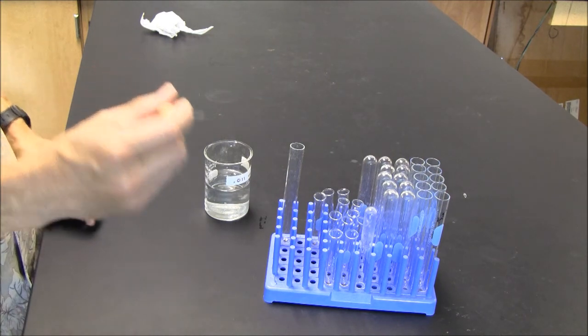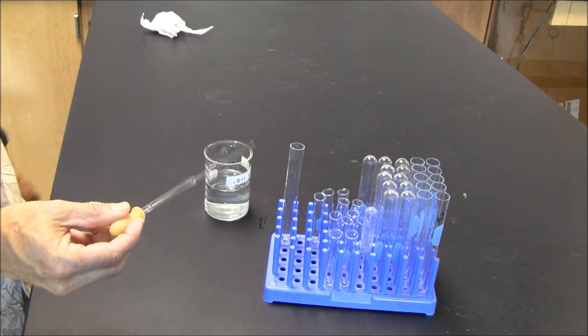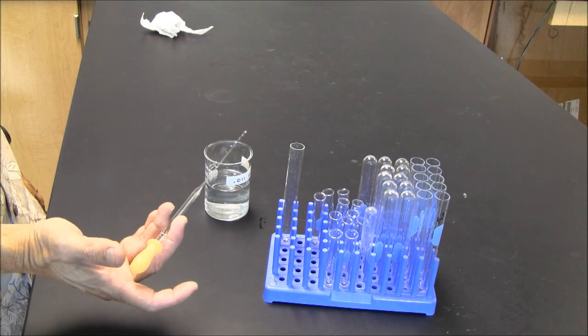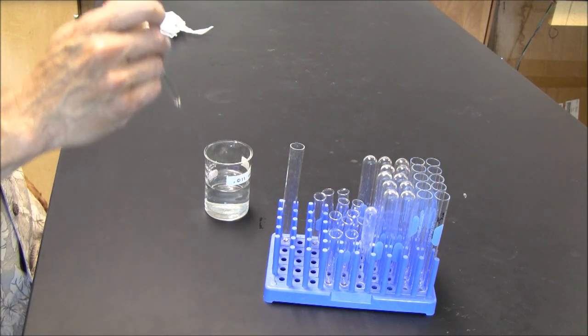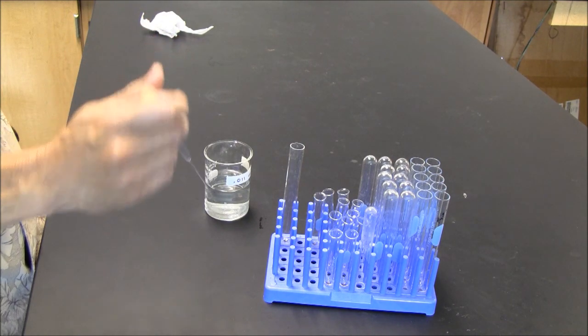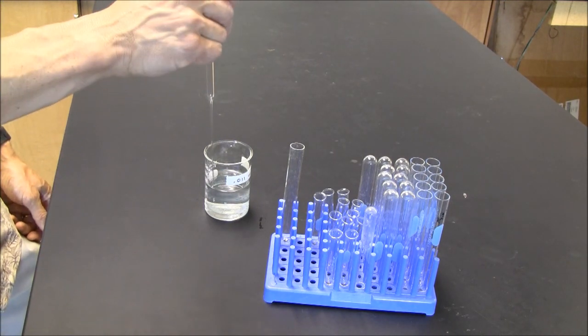Beginners tend to grab only the bulb. And as you can see, the pipette is very wobbly if you do that. So you want to get a couple of fingers on the glass, and that will hold your pipette more securely. Very steady.